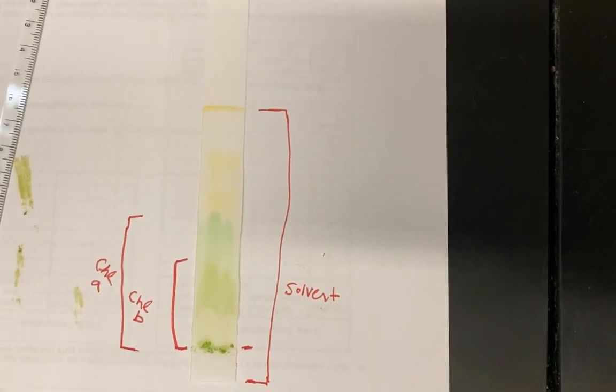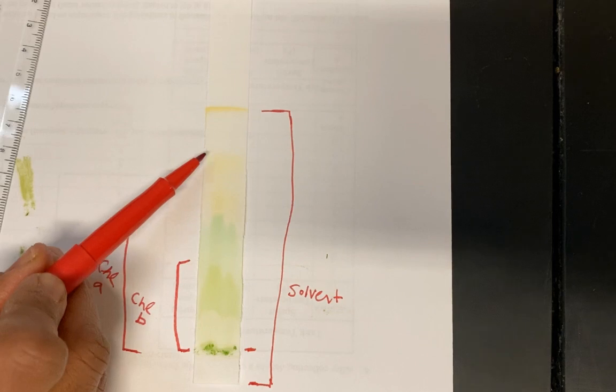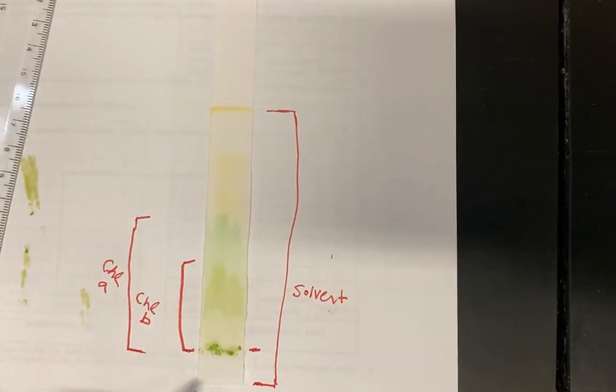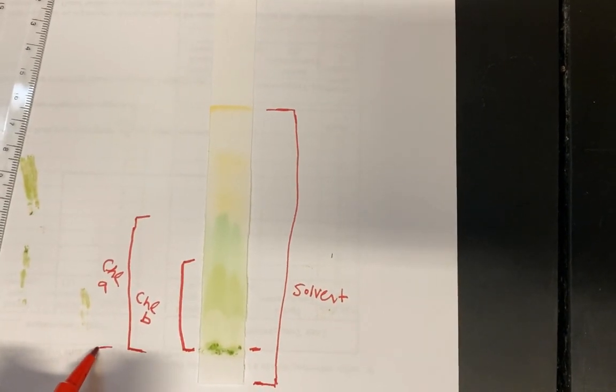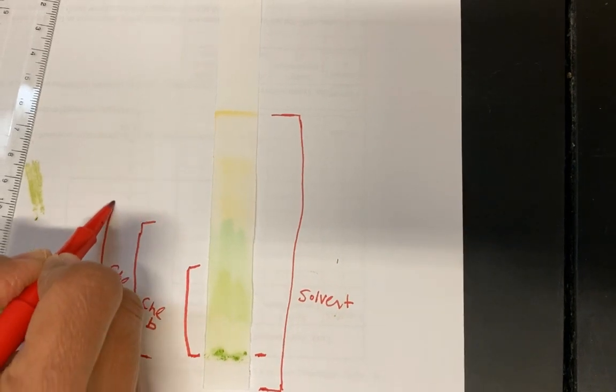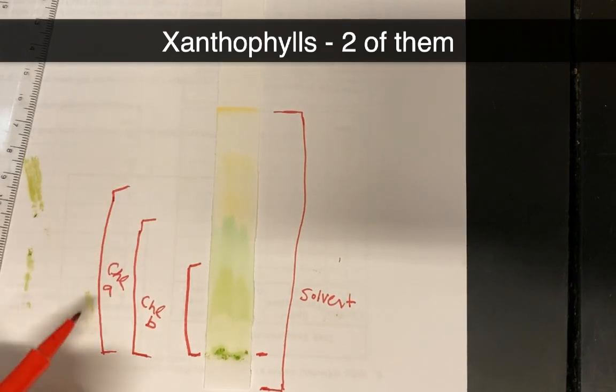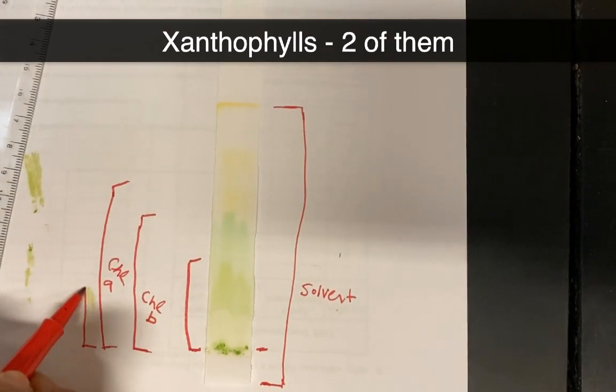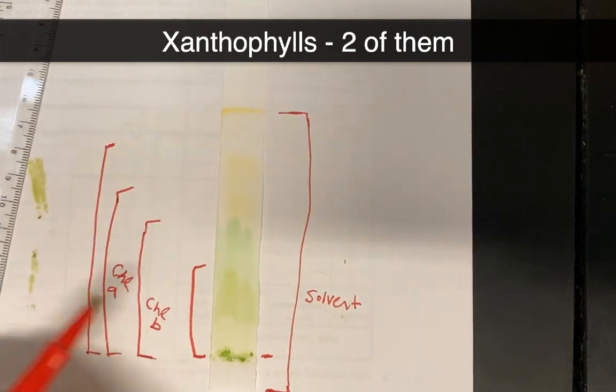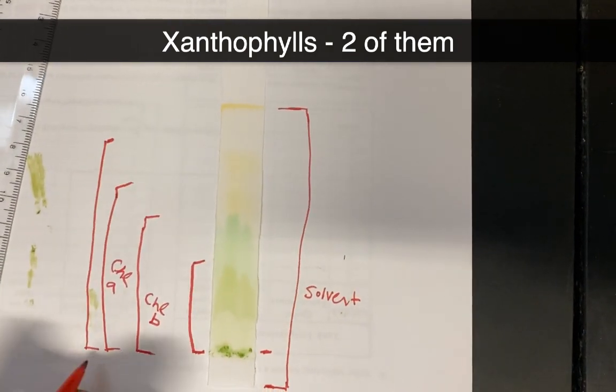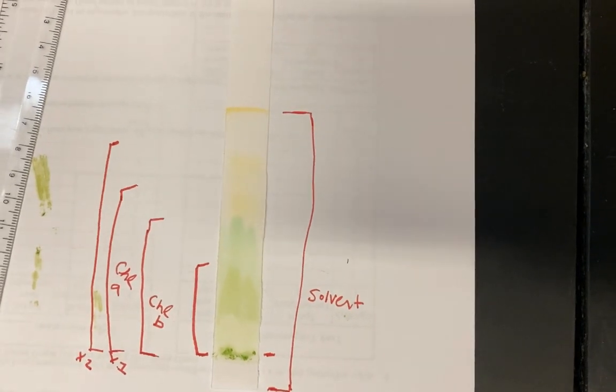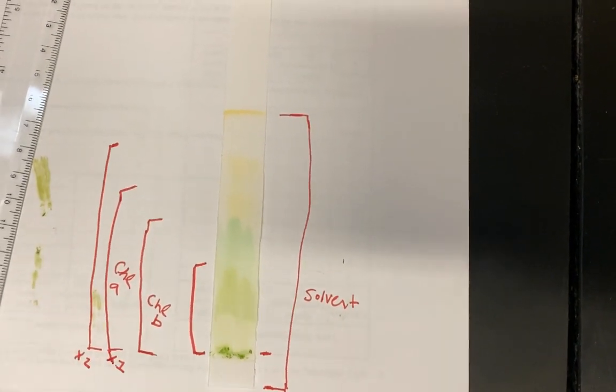All right. Then there's these two yellow bands. These are the xanthophylls. So my xanthophylls are going to travel up. One kind of hard to see the separation. I think maybe it's over here somewhere. That's one of them. And that's maybe about where the other one is. So this is xanthophyll 1 and xanthophyll 2. It doesn't matter which one's 1 and which one's 2, but we'll just label it that way.